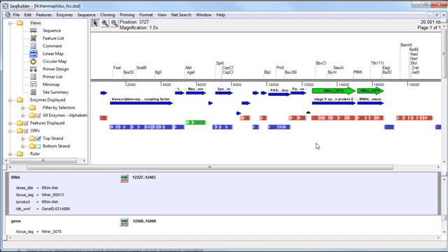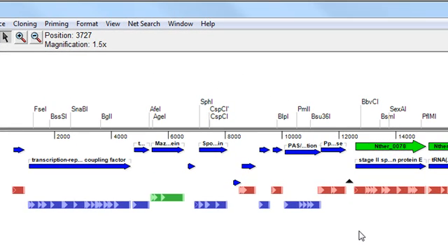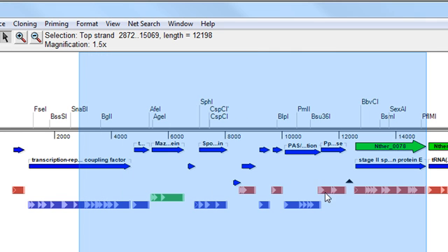So to create a custom TOPO vector for your project, just open the sequence you want to use. Highlight the portion of the sequence you want to use as a vector. And here's where the shortcut comes in.